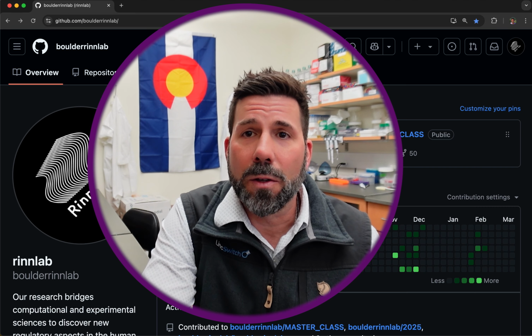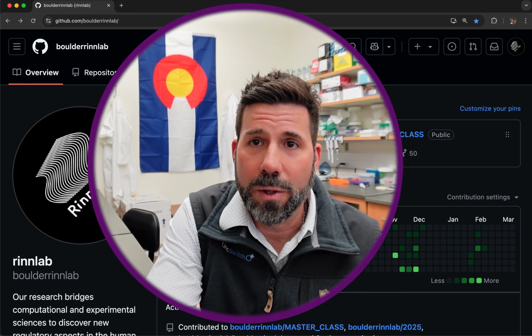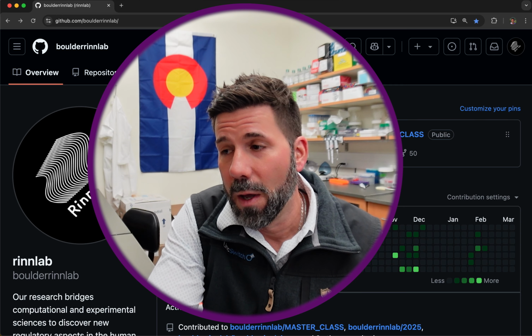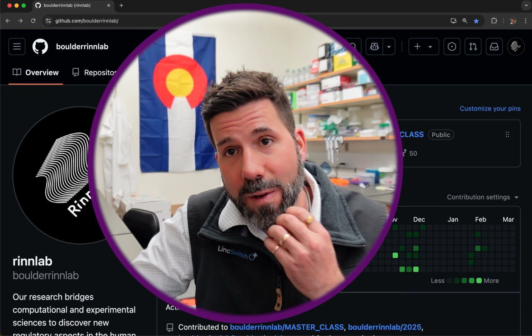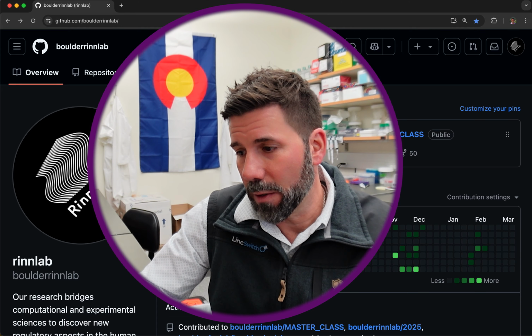Today we are going to continue our journey with genomic ranges, or G-ranges, and look at some of the annotation features of the human genome. This is probably one of the most useful parts of G-ranges, keeping track of all those layers of starts and stops of all these different features of our genome. Alright, so let's go take a look.